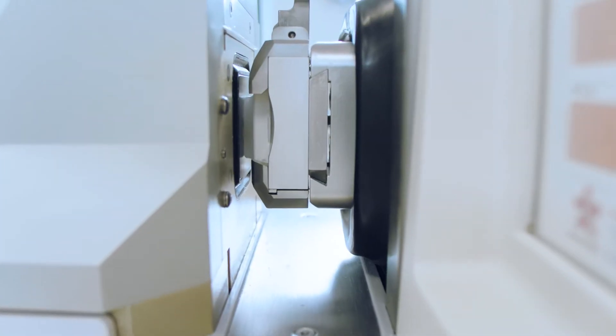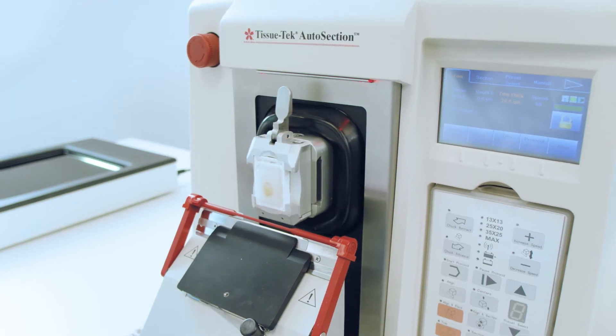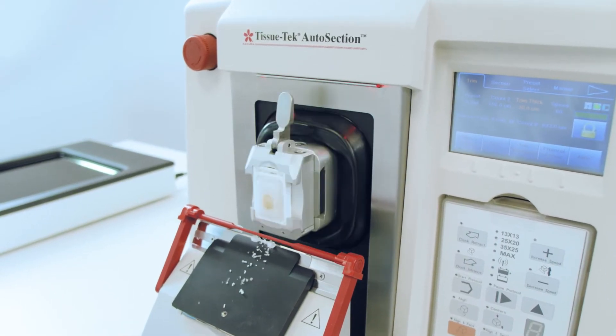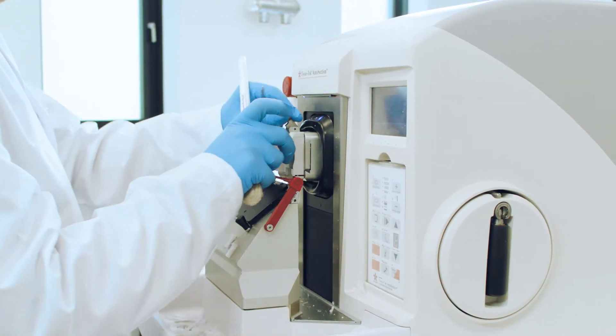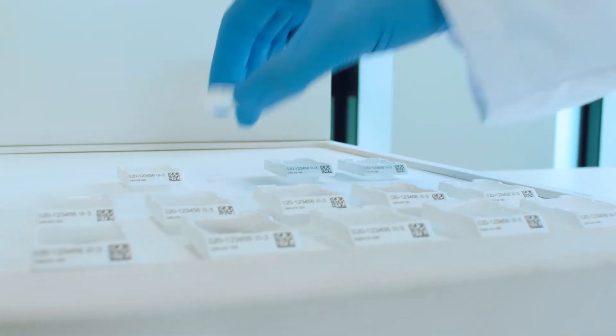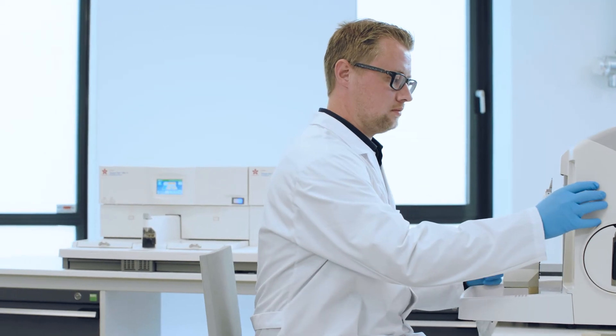The automated block alignment makes sure precious tissue is preserved optimally. It is also a great help for making recuts, while the perfect alignment helps me produce even more slides.